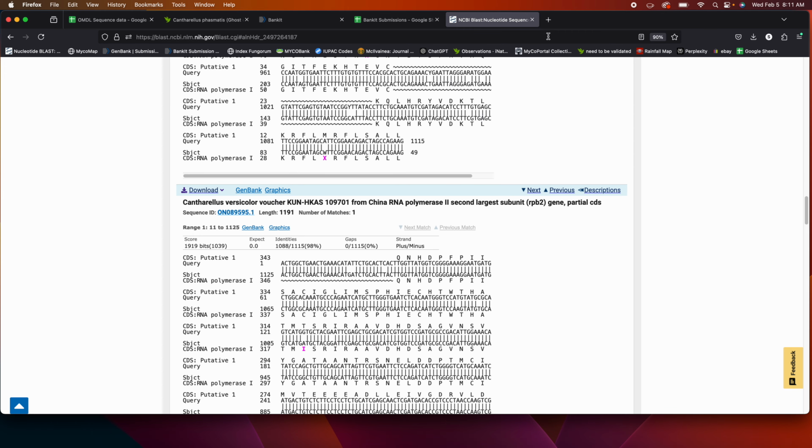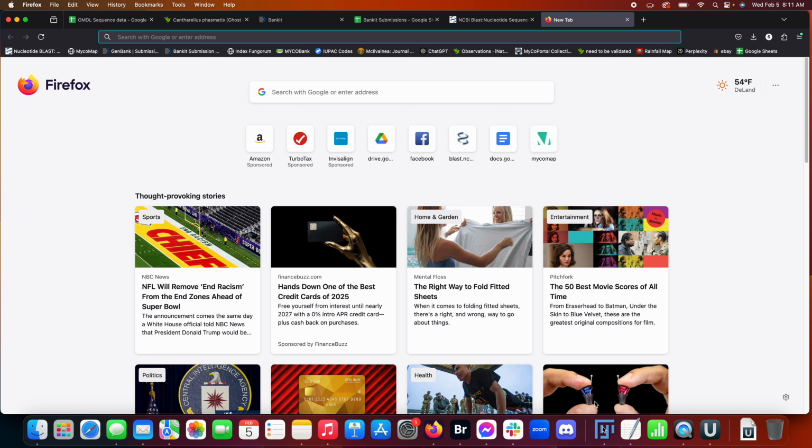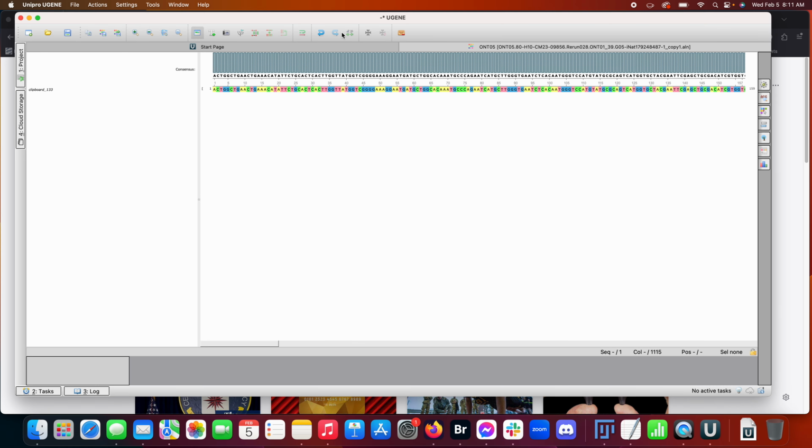Okay, so this needs reverse complementing.